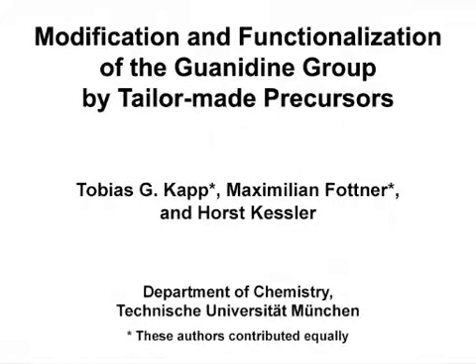The overall goal of this procedure is to provide a convenient synthetic access to guanidine functionalized peptides. This method can help answer key questions in the field of medicinal peptide chemistry, such as the development of integrin ligands or GPCR ligands. The main advantage of this technique is that it allows an easy synthetic access to functionalized guanidines, completely compatible with SPPS.